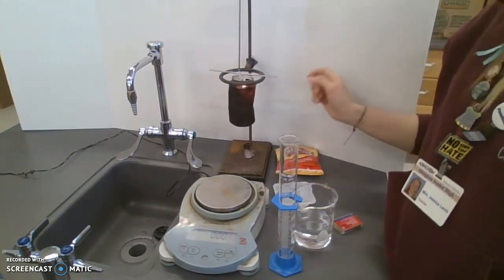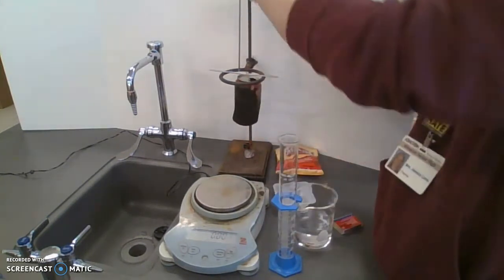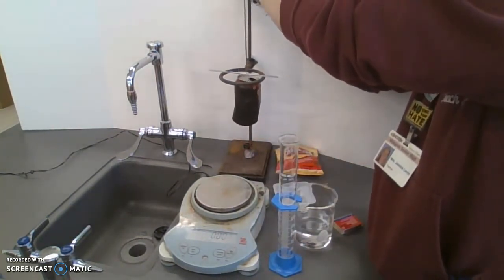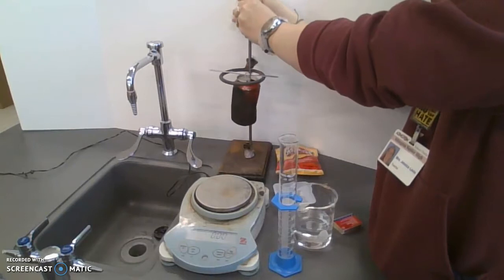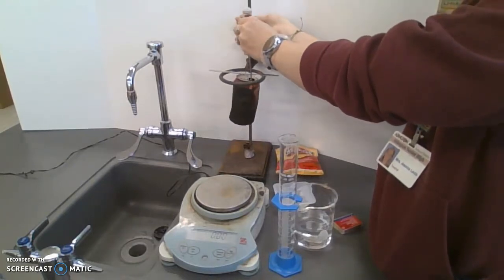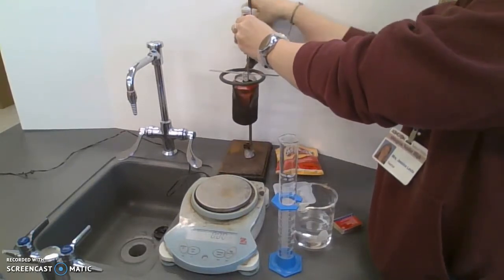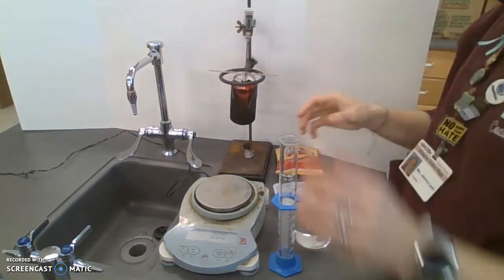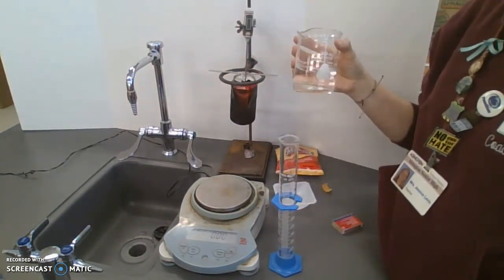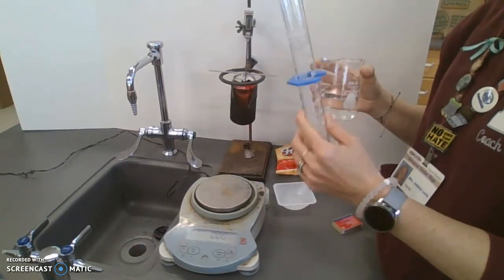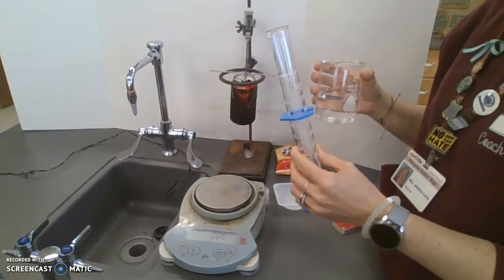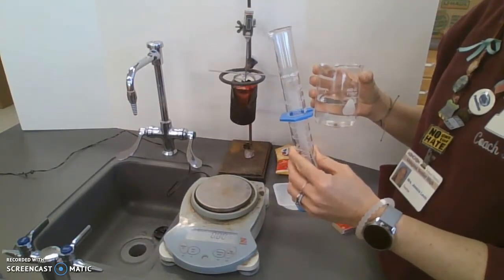So we are going to use a soda can. Up here we have a thermometer that we're going to put inside the soda can like so that will tell us the temperature of the water inside. We have some water and a graduated cylinder so that we can end up measuring how much that's going to be.